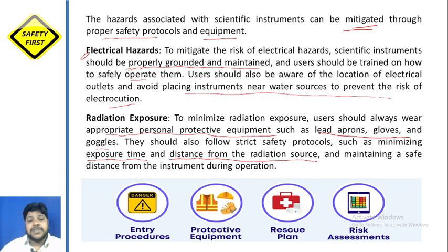Maintaining a safe distance from the instrument during operation, whenever it is working. So it should be avoiding the exposure, avoiding it by all possible means.